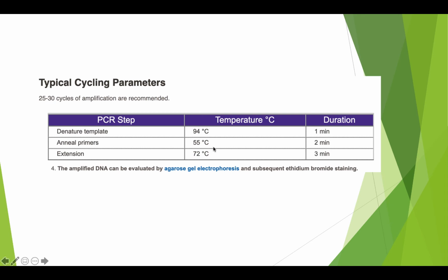If you raise the annealing temperature, the opposite happens. Specificity becomes very high, and you might get false negatives. When might I want to raise the temperature? If I'm looking, for example, for a single nucleotide error, I don't want the primer to bind if there is one wrong nucleotide, so I raise the temperature. If I'm not very sure about my DNA, or I'm unsure about what I'm looking for, I might lower the temperature a bit. This is where user expertise comes into play the most.